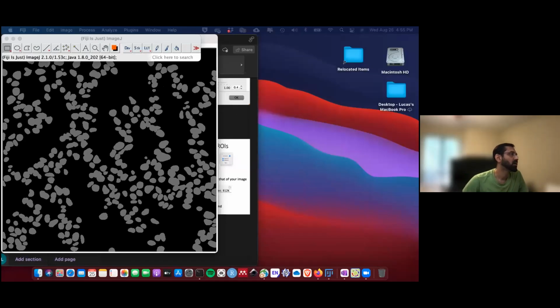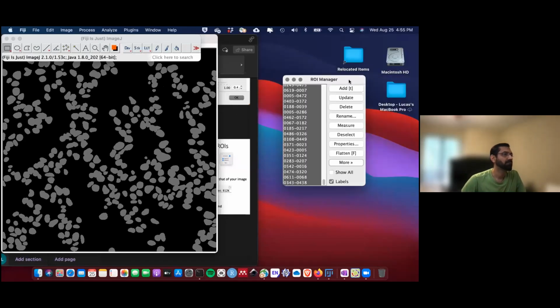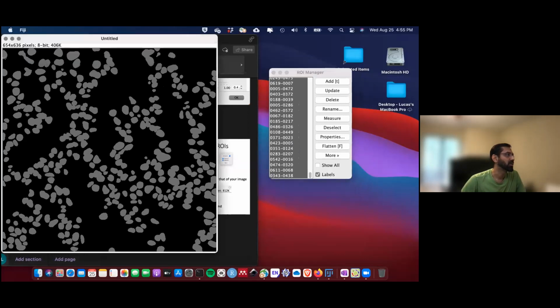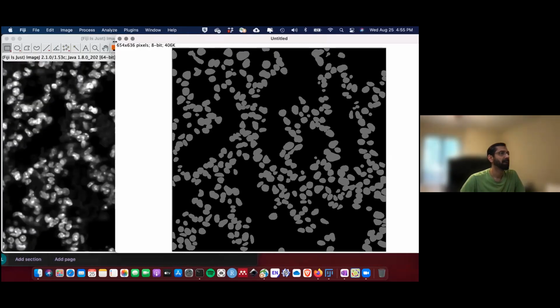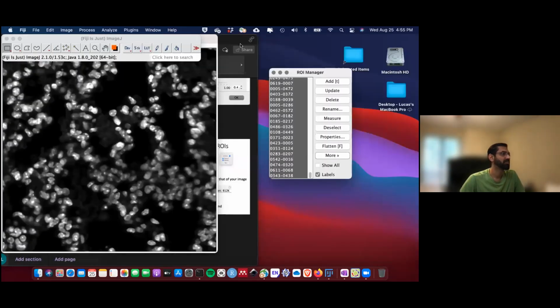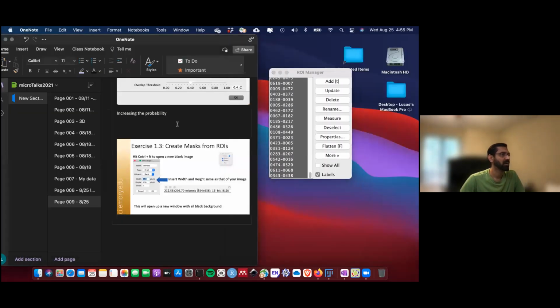Okay, I guess you guys are seeing this screen here. The bar from the Zoom doesn't allow me to get to the image. There you go. I'm going to close this one, okay? And I'm going to generate the new one.